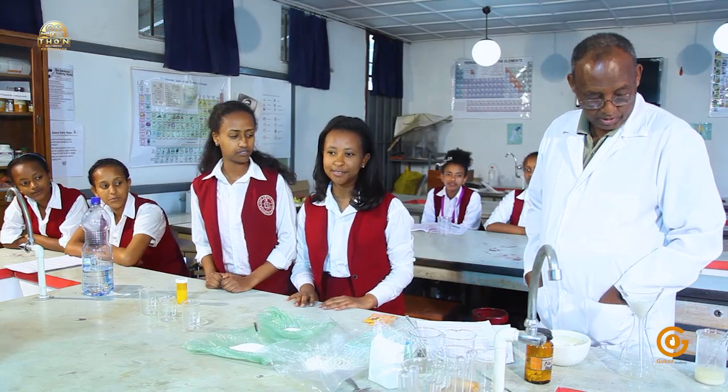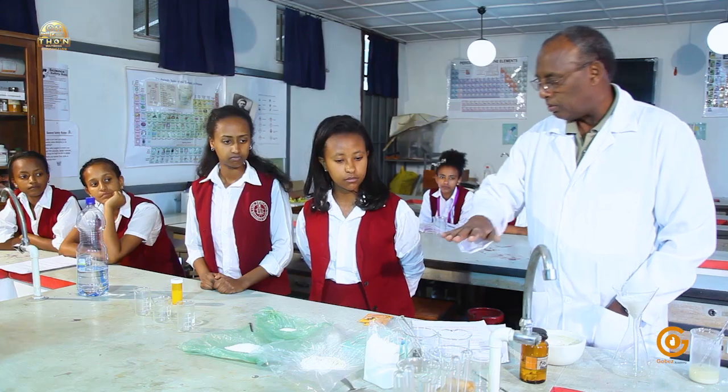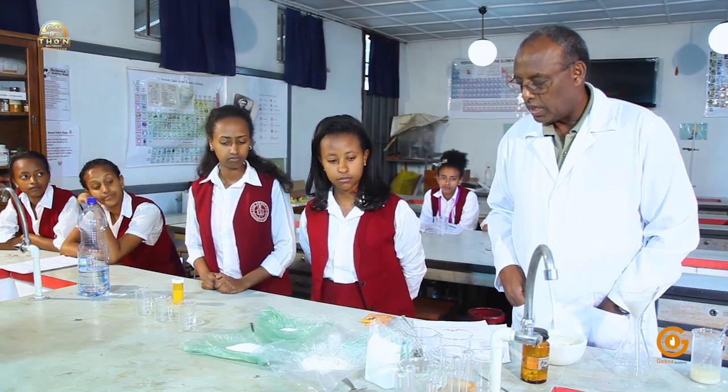Good afternoon, students. Today we have 3 experiments to perform, all of them on solubility of substances. The substances that we'll be working on are displayed over here.